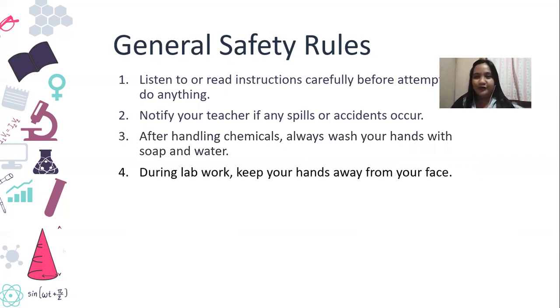Okay, during lab work, keep your hands away from your face. Of course, it's chemistry. We're handling chemicals. So you have to refrain from touching your face because normally what we just ask you to wear will be your laboratory gowns, and we don't really require you to have a face mask like what we have now, or goggles or gloves. So please prevent your hands from going to your face.